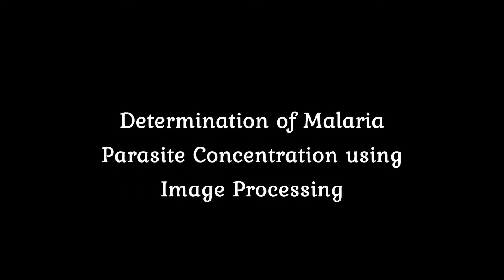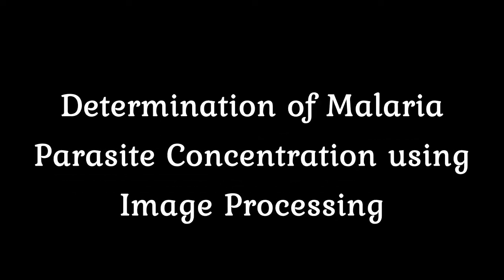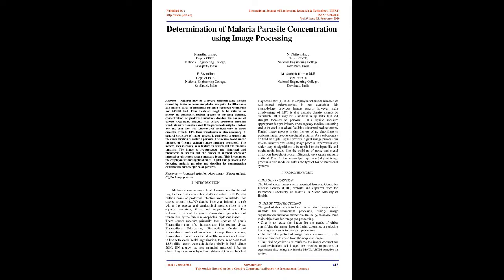Determination of malaria parasite concentration using image processing. Abstract: Malaria is a severe communicable disease caused by the female Anopheles mosquito. In 2016 alone, 216 million cases of malaria occurred worldwide and 445,000 died.